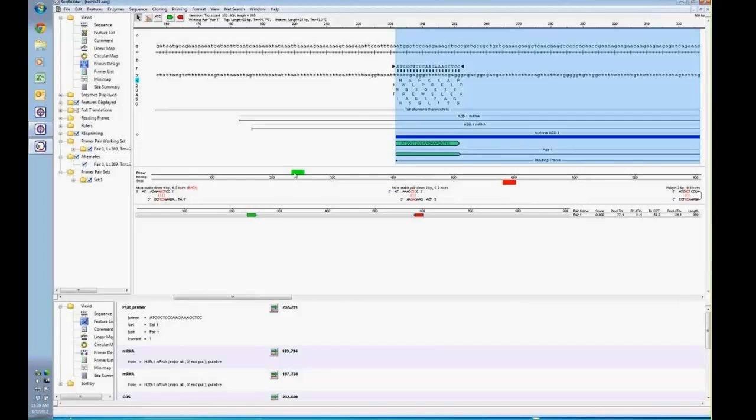In this specific case, it's only showing a top strand and a bottom strand. It's going to show you the stable dimer information, the most stable pair dimer information, as well as the hairpin information. One thing that you'll note here is that, based on the default parameters that we selected, these two primer combinations may not be optimal for most stable dimer formation. So the software will identify and tell you that this combination is actually pretty bad. They wouldn't recommend that for most stable pair dimer creation here.